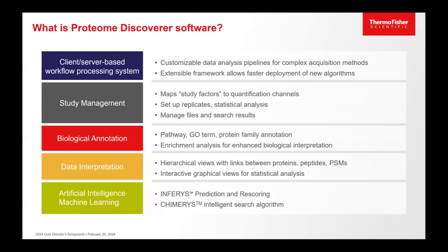This allows us then to do statistical analysis, replicates, better visualization, and we produce the results not as a mass spectrometry by file, but actually if you use study management, it'll do it by sample. So that it makes it easier for non-mass spectrometrists to interpret the results.